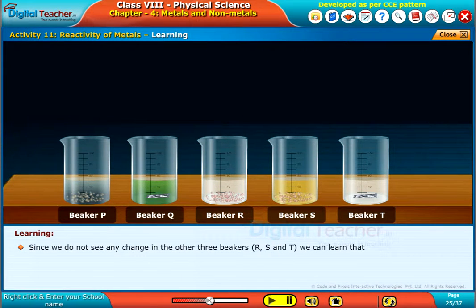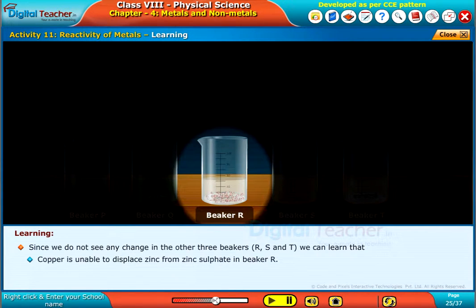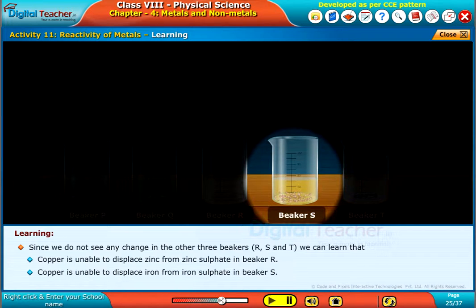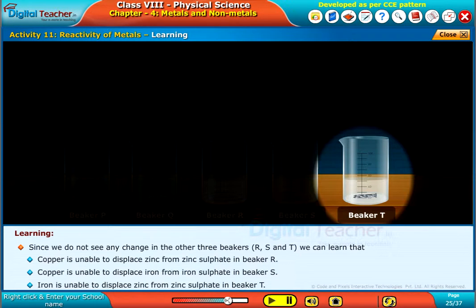Since we do not see any change in the other three beakers R, S and T, we can learn that copper is unable to displace zinc from zinc sulphate in beaker R, copper is unable to displace iron from iron sulphate in beaker S, and iron is unable to displace zinc from zinc sulphate in beaker T.